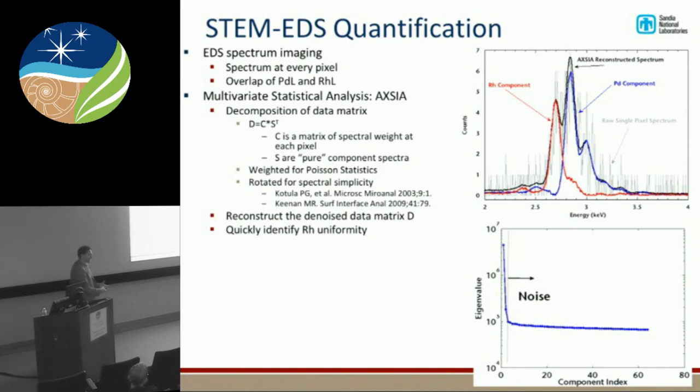When we do that, it's basically an eigenvalue problem of a sparse matrix. We solve that problem, and what we find when we look at the eigenvalues, in this plot called a scree plot, which is a way of looking at variance in all the data, is that here we have a high value, here a little bit higher, and then all of these values for the rest of the eigenvalues are roughly the same. That means the data doesn't change much by using these eigenvalues in the problem. So we can get rid of all of these, and we only have to look at the first two.